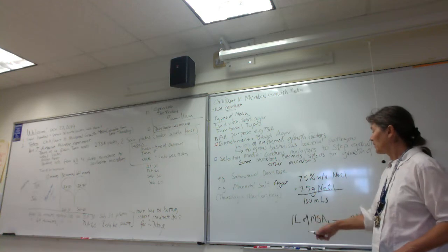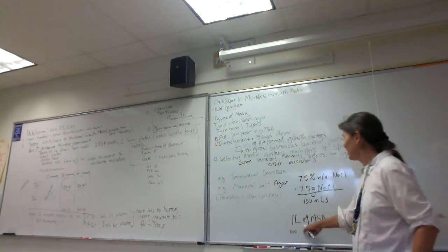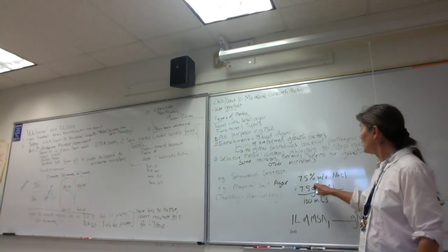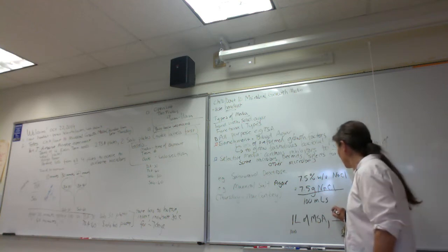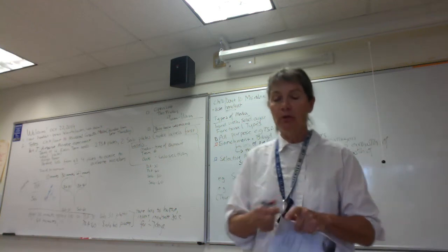So 1 liter is 1,000 mL, right? So how many 100 mL are in 1,000? 10, right? 10 times 100 is 1,000. So you guys, how many grams of sodium chloride would you add to a liter of MSA? 75 grams. Good. Okay, and that's kind of a classic lab exam 2 question.